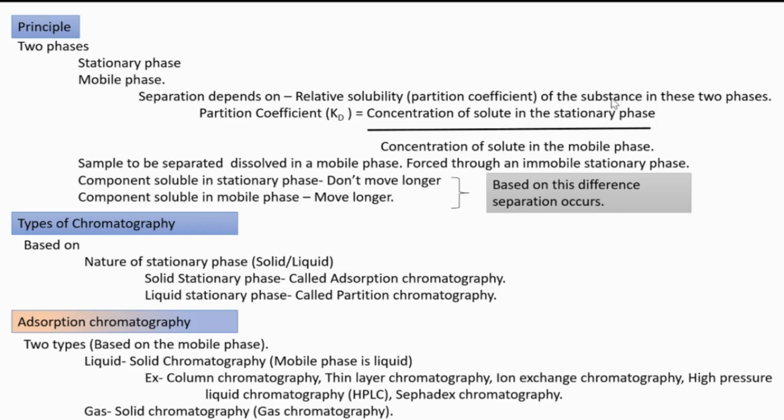Substance means the mixture that we need to separate into component parts. Based on its solubility in these two phases, we are separating that mixture.